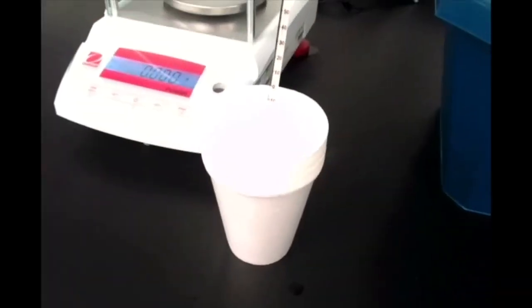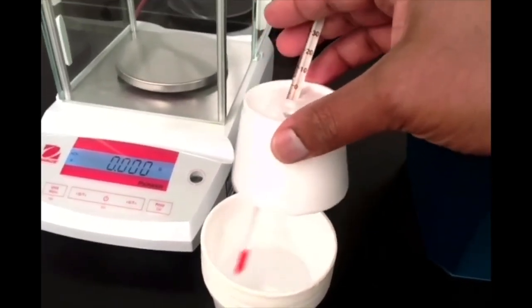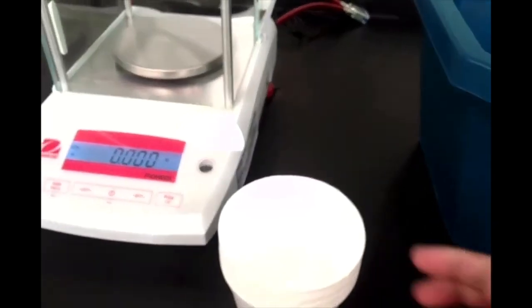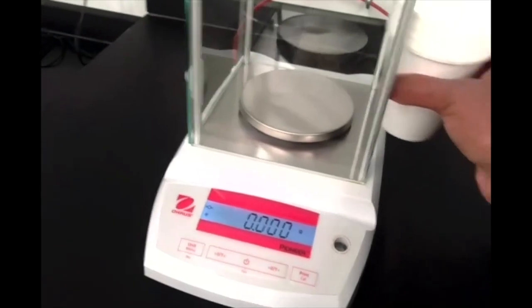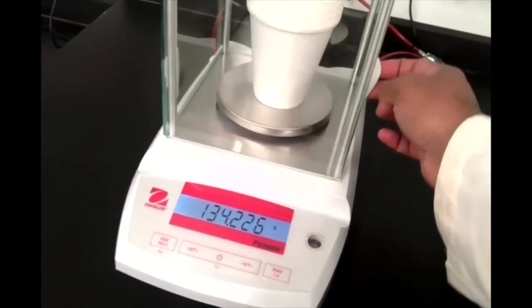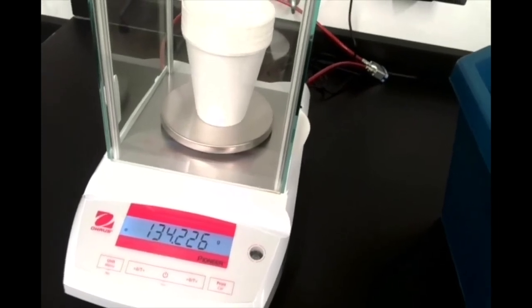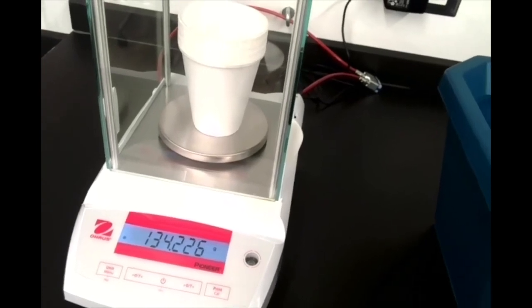Okay. All right, now that we've gotten back to our final temperature, let's take out our thermometer. And let's make sure we don't have any drops of water sticking to that. Set that down. And let's get a final mass reading for our water and our styrofoam cup. So you can see it's already zeroed before I had it in there. Alrighty, and that's our final mass for our styrofoam cup, the water we started with, and the ice that melted. So make a note of that.